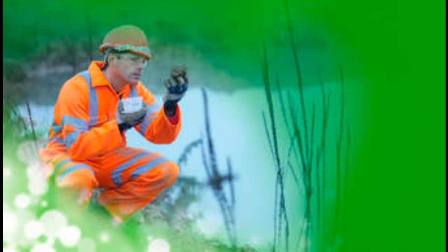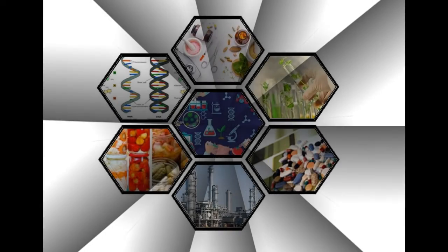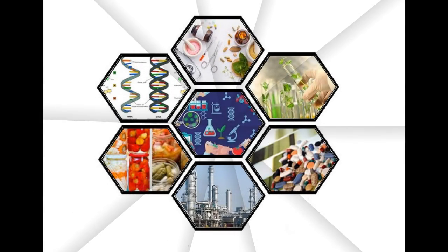The GCMS is used in a variety of different disciplines in chemistry: astrochemistry, medicine, geochemistry, industrial, security, law enforcement, food, beverage and perfume analysis, sports anti-doping analysis, pharmaceutical, biological, geological, environmental, and forensic research.